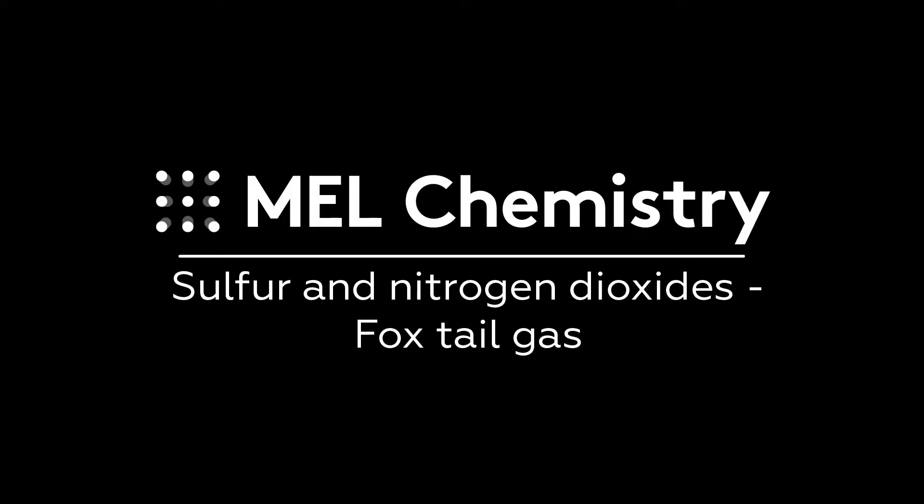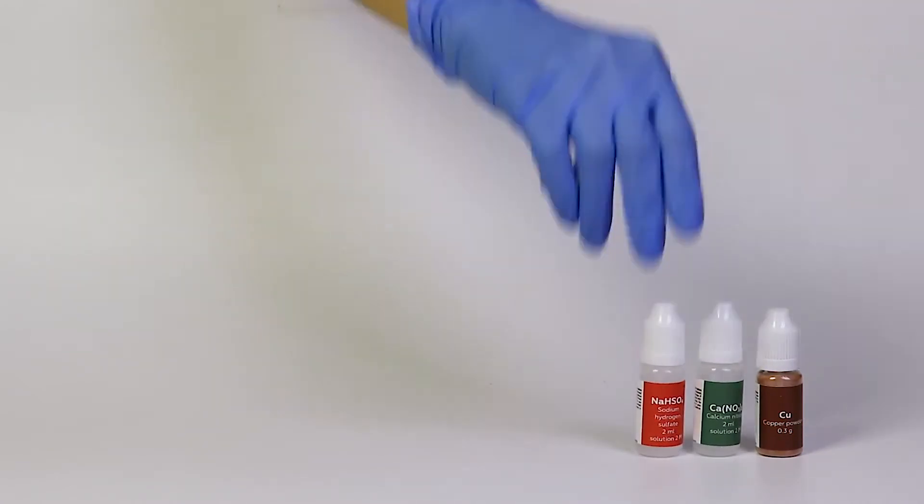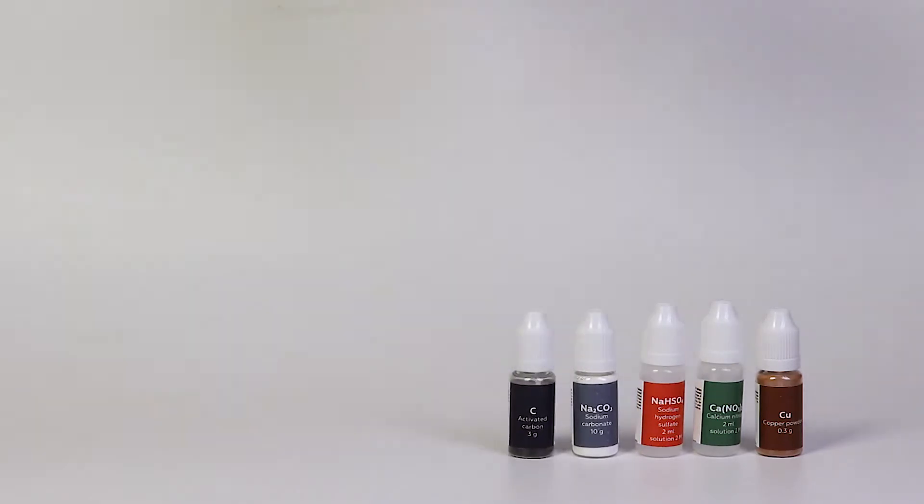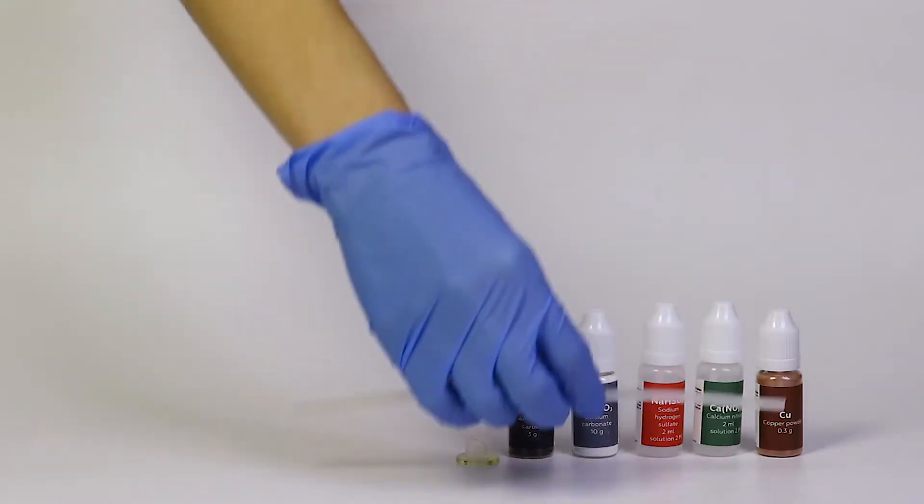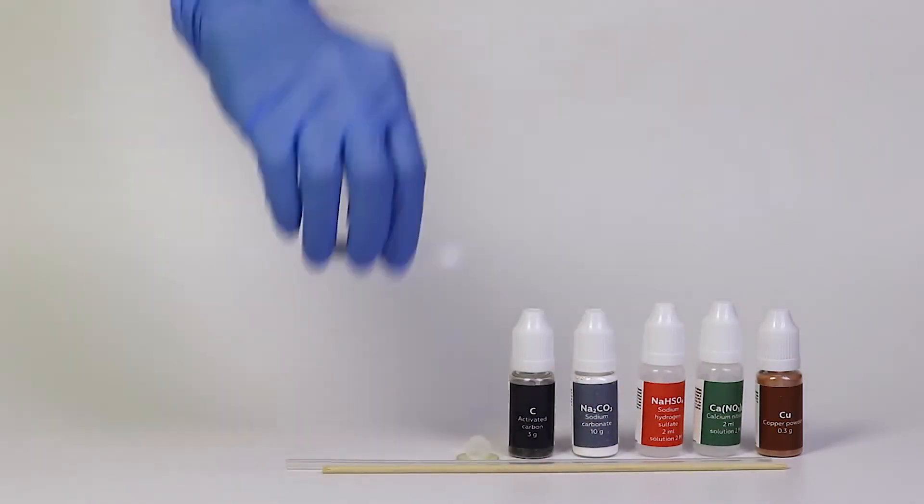For the foxtail gas experiment, you'll need copper powder, calcium nitrate and sodium hydrogen sulfate solutions, sodium carbonate, activated carbon, a plastic ring, a nozzle, a silicon tube, a wooden stick, and a measuring spoon.